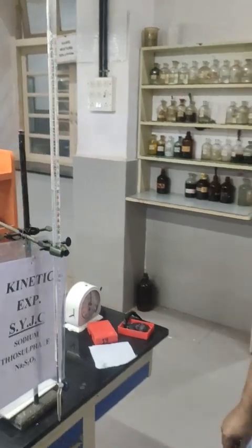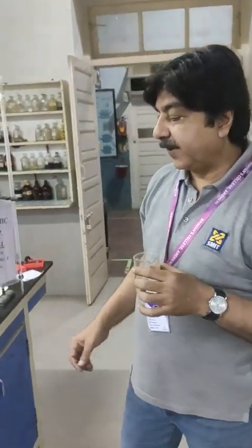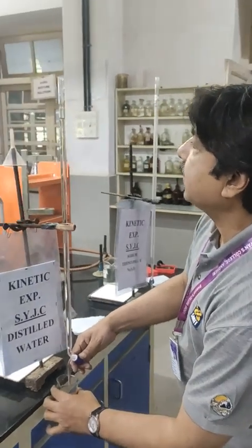So I have taken 20 ml of sodium thiosulfate. Now to this I will be adding 28 ml of distilled water, in the same container.